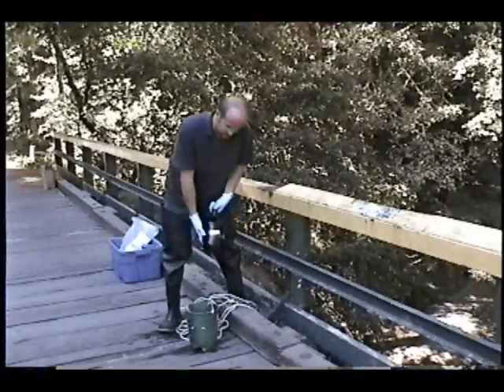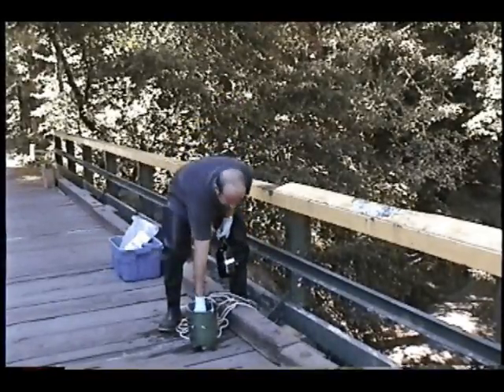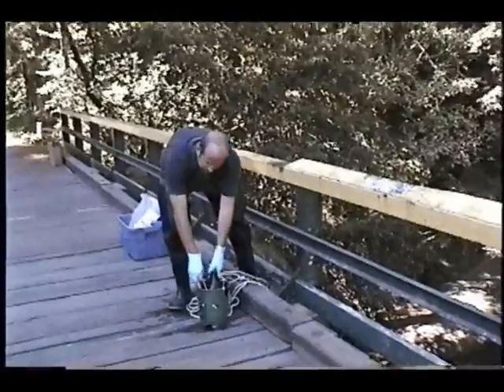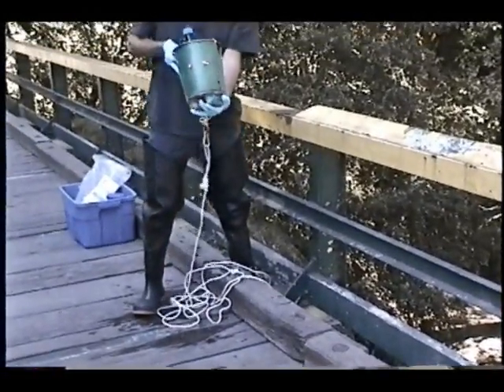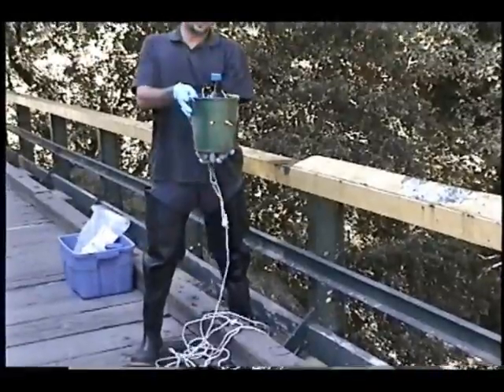It consists of your sample bottle and a weighted bucket. I'll put the bottle in the bucket. The bucket has weights on the bottom to make sure the bottle sinks enough into the water.